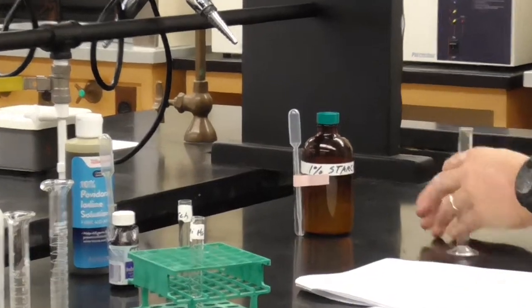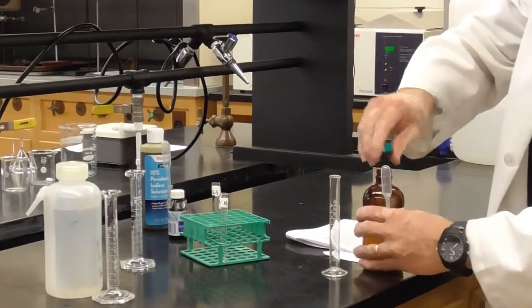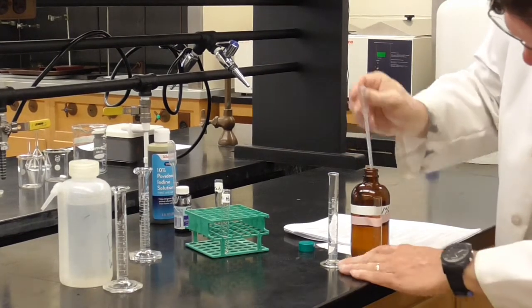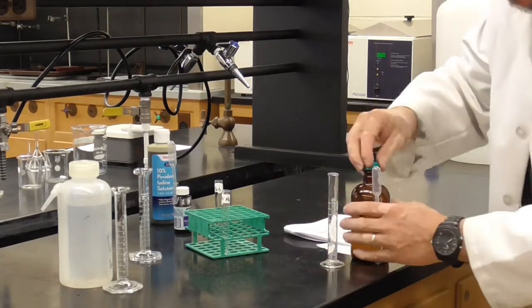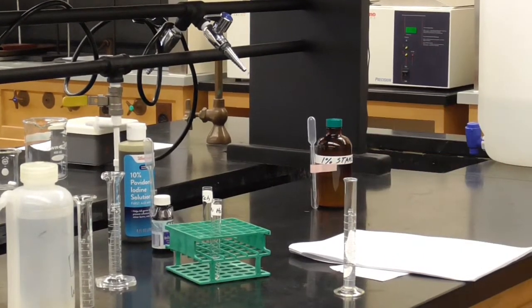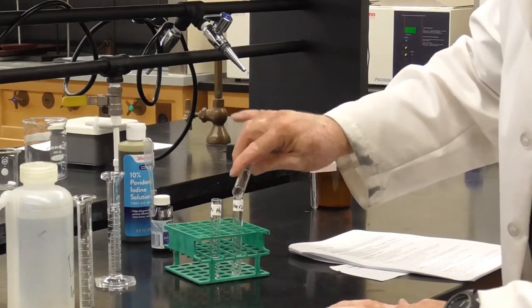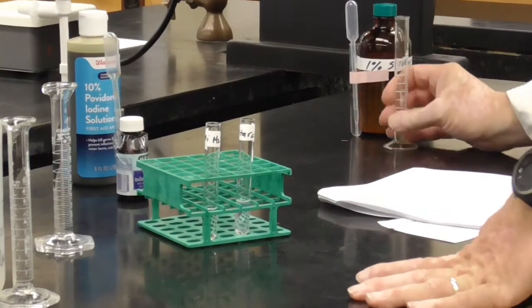Okay, and then starch, we have a 1% starch solution. This will be our positive control. Again, take 3 milliliters. Of course, we like to eat starch as well. We do have the ability to digest it, right? And we've got a lot of starchy things like potatoes, which are well known for lots of starch. Which makes sense because that's a root, and the roots often store the nutrients, and starch is stored carbohydrates. So, yeah, it makes sense.